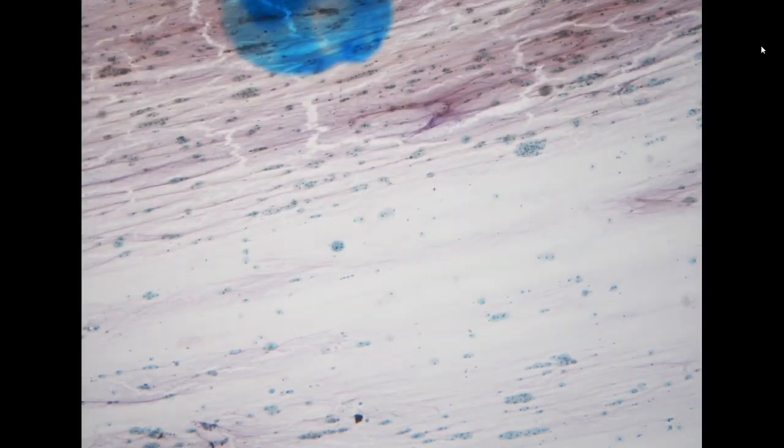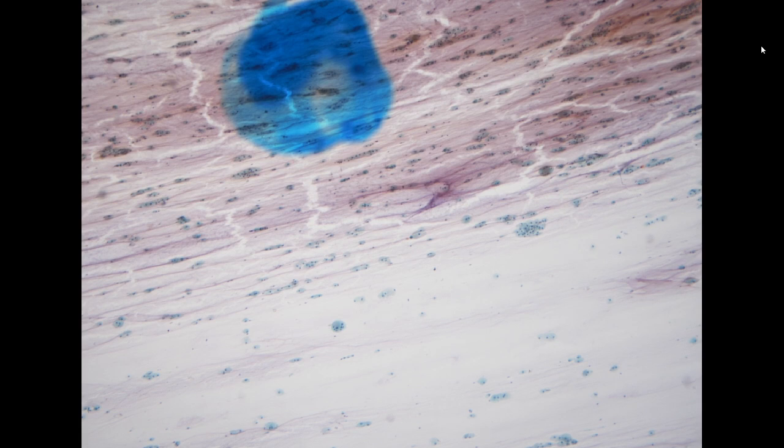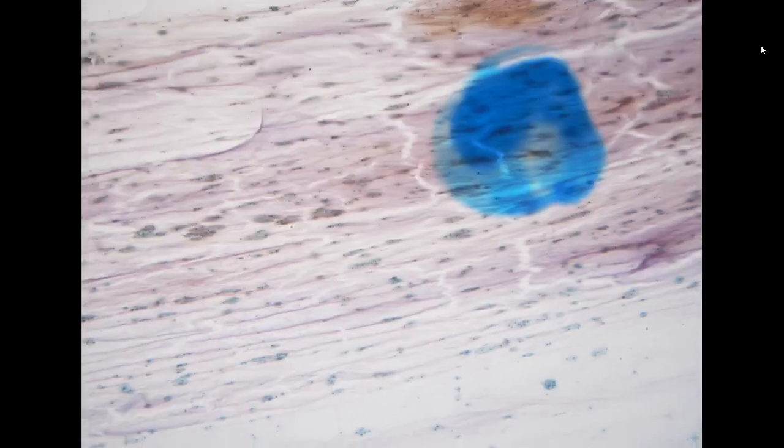So let's move to pap smear. This is a 92-year-old female. Theoretically, we don't need to screen patients for cervical neoplasia after the age of 65. She has been proven to have HSIL last year. So you can develop HSIL at the age of 92. This might probably be the oldest HSIL patient that I have ever seen. So we never say never, okay?